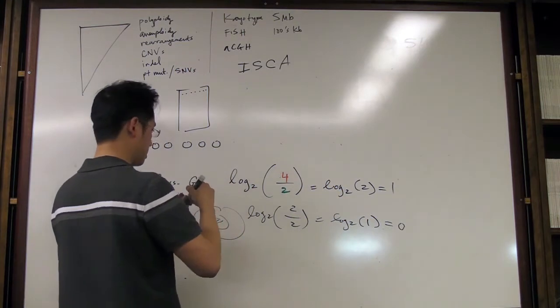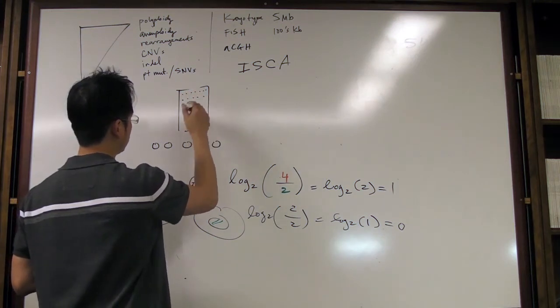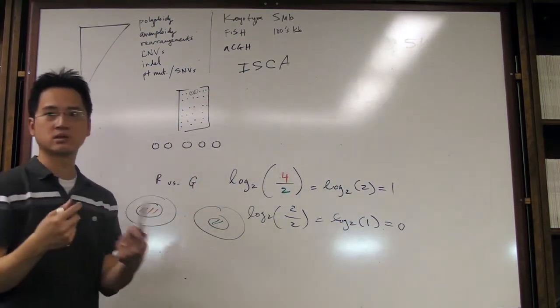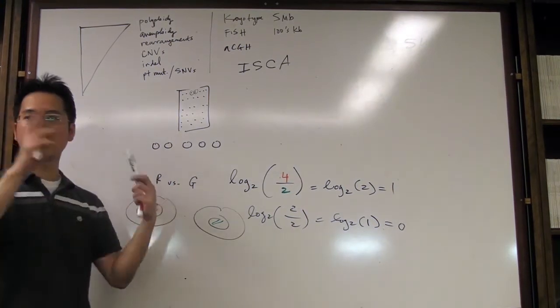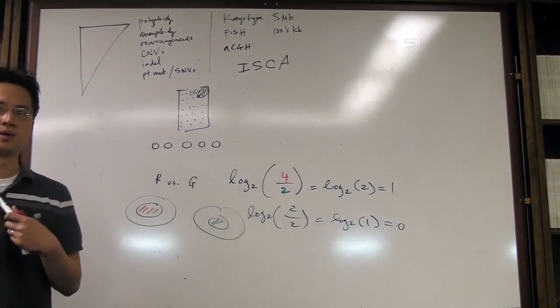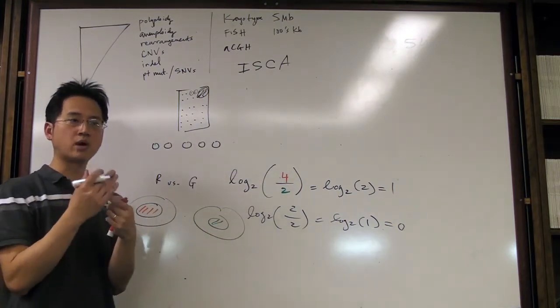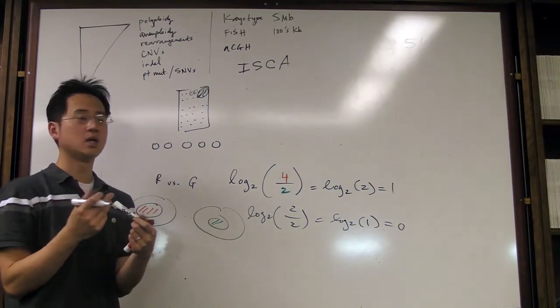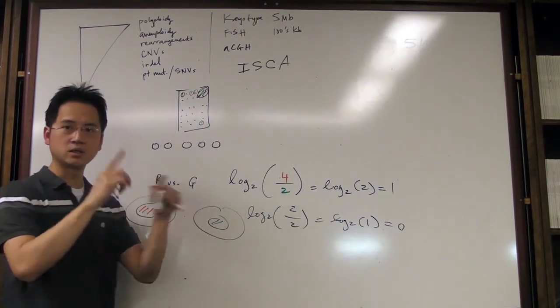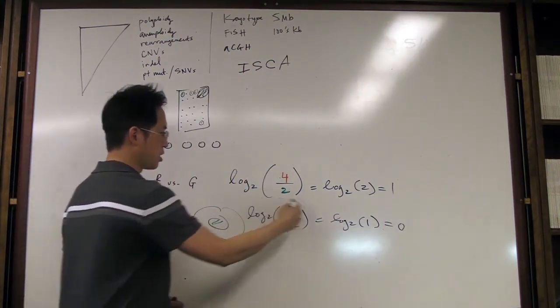And what you do is you take adjacent probes. So here on the slide or the array, you have those 180,000 probes. The way it's designed is that this probe right here is not going to be right next to that probe. You don't want to design that way. You want to spread it kind of randomly across the chip. And the main reason is if you have some bubble or something that happens right here, or some lint or dust that contributes to the signal, you don't want all those neighboring probes to be right next to each other because it's going to give you a false positive call. So instead, you're going to spread them out. So maybe this is the coordinate that's right next to this one, and you kind of distribute it out. So you do across all of that, and you rearrange them back in order in terms of genomic position, and you express it as this ratio here.